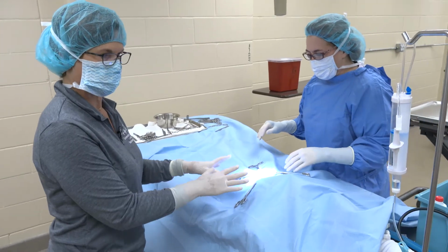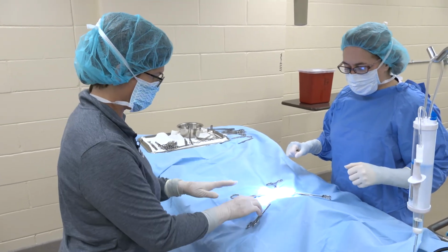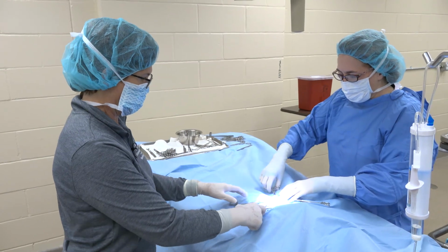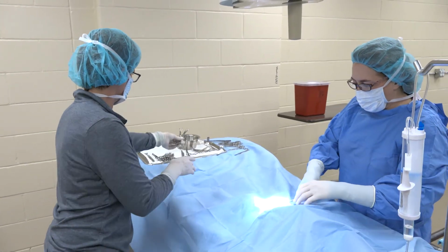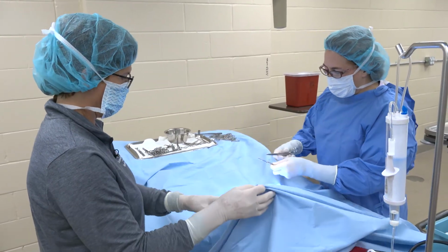Okay, so surgery has been finished. Obviously, we've been documenting the anesthesia and everything. For our dry run, we're going to have you reset the station. So in real life, we'll have you guys wash your instruments and such, get rid of your sharps. That's the surgeon's responsibility. So I'm taking my blade off.